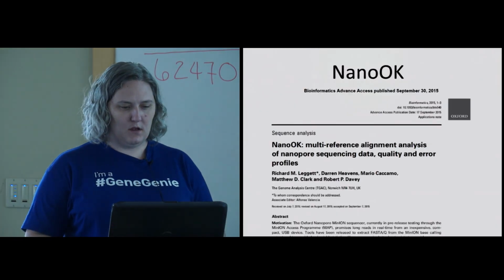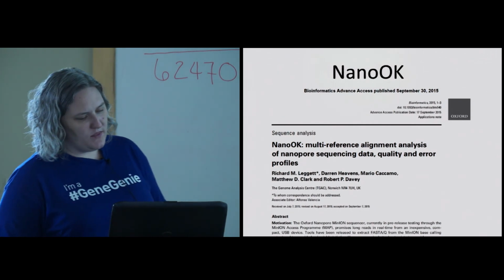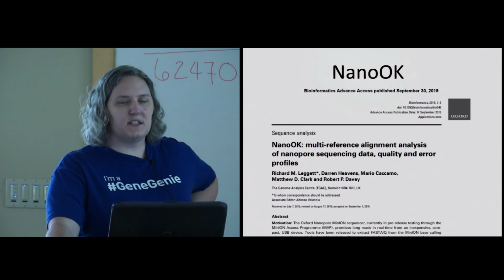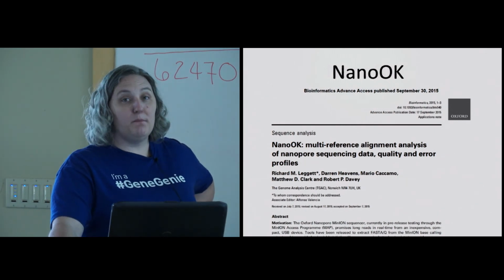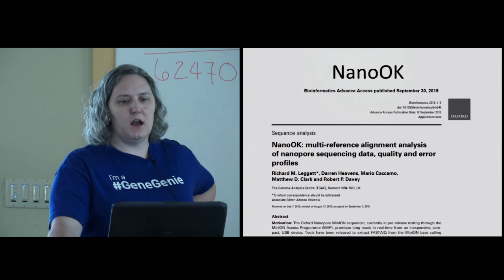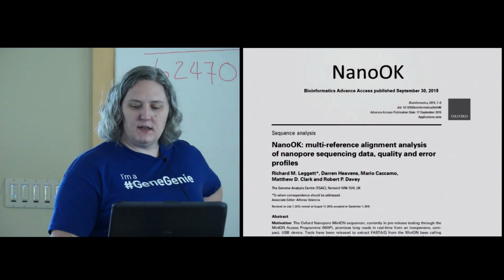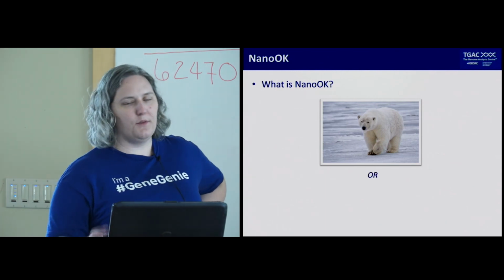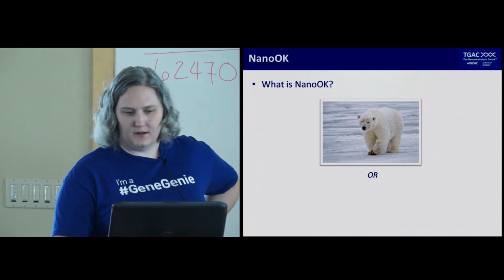Here we go. So there is another one. This is Nanook. This is yet another thing similar to Minotaur. This is not going to have quite the same level of alerts and interactivity, but it's a very similar process as well. Nanook, Nanook of the North, polar bears, that's what the folks named it.